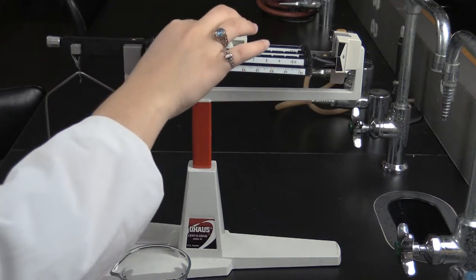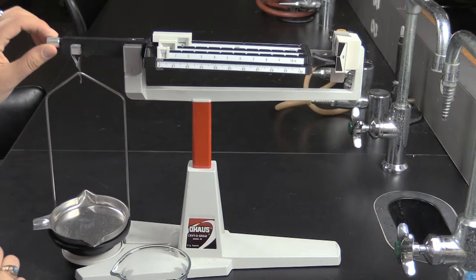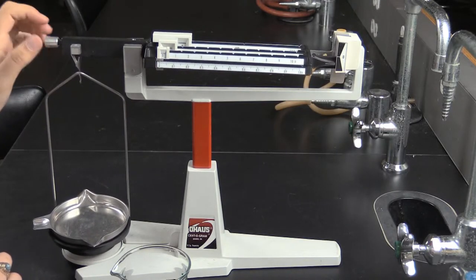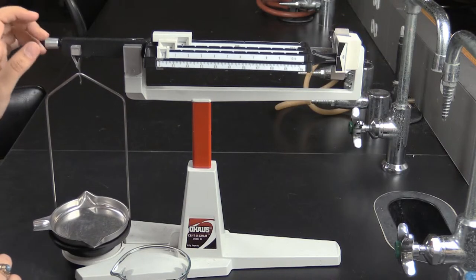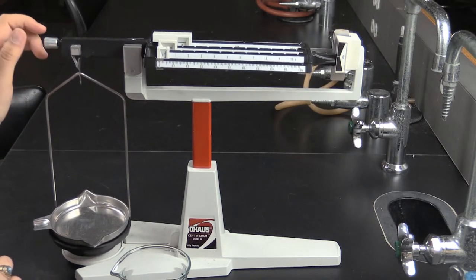First, slide all of the sliders to their zero marks. These can be found on the far left. Once in this position, the knurled nut on the left side of the beam is loosened or tightened until the beam line on the right lines up with the line on the fixed portion of the balance.